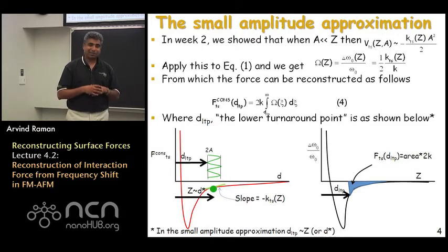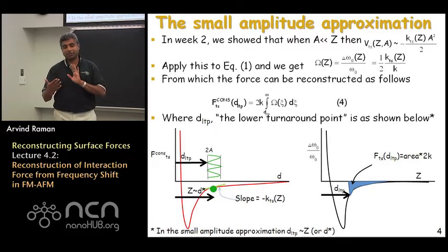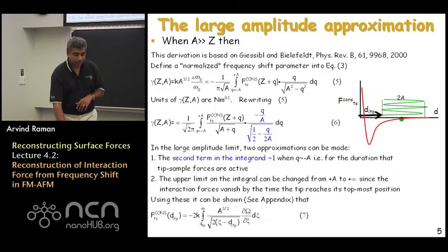However, it requires the oscillation amplitudes to be extremely small compared to the interaction length scale of the tip sample forces. And so this formula would obviously not be valid for short-range interaction forces, but for long-range interaction forces like long-range electrostatic forces, it might still be used.